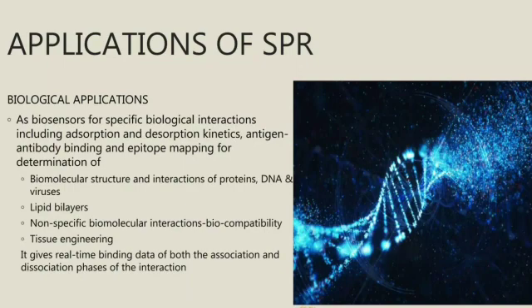This technique gives real-time binding data of both the association and dissociation phases of the interaction.